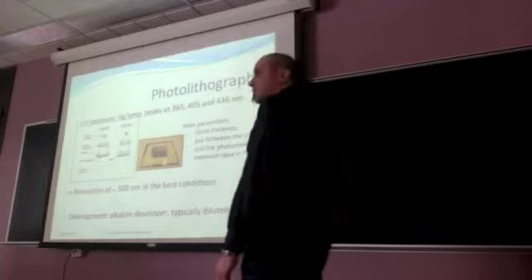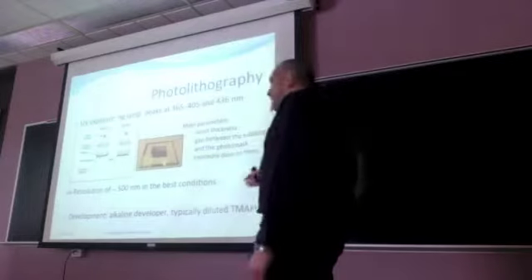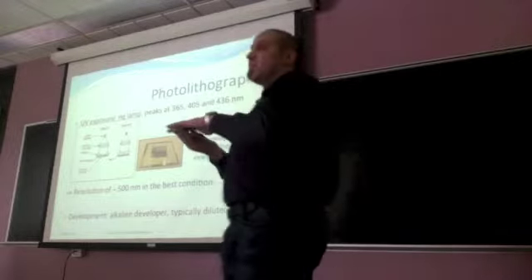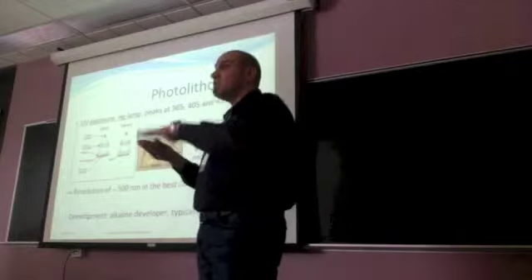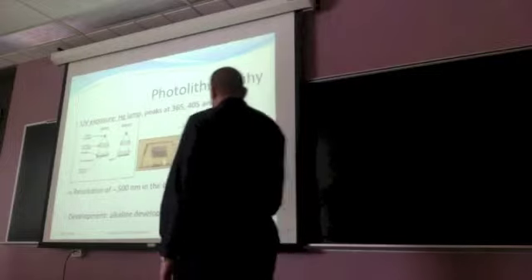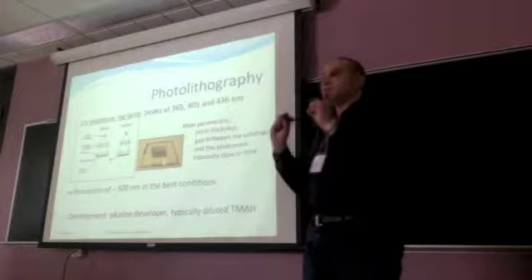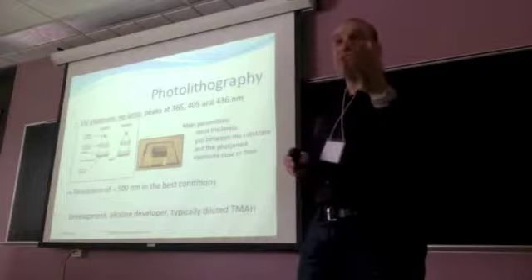We can expect a resolution of about 500 nanometers in the best condition. And best condition means that there is no gap between the substrate and the photomask. Otherwise, the patterns will be deformed because of UV diffraction. These conditions sometimes are very difficult because you have to keep the photomask and your wafer clean. If you have a particle, for sure, it will be very hard to get a good contact. And also the edge bead I talked about should be removed to get a very good contact.